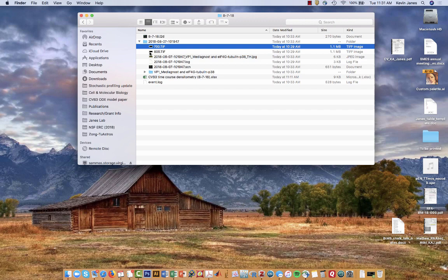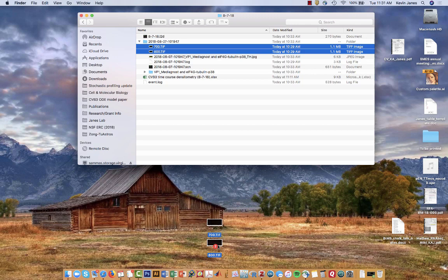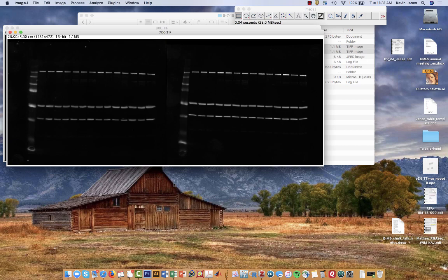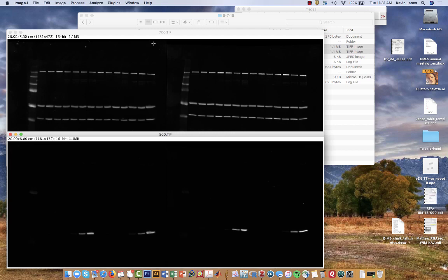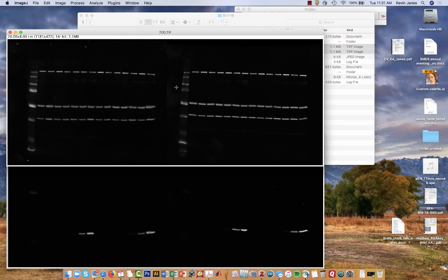I'm going to take these two images and open them in ImageJ. We do all of our quantification in ImageJ because it can appropriately handle the 16-bit images quantitatively without manipulating the numbers that go into the densitometry. Here's the 700 channel and here's the 800 channel. We're going to start with the 700 channel.